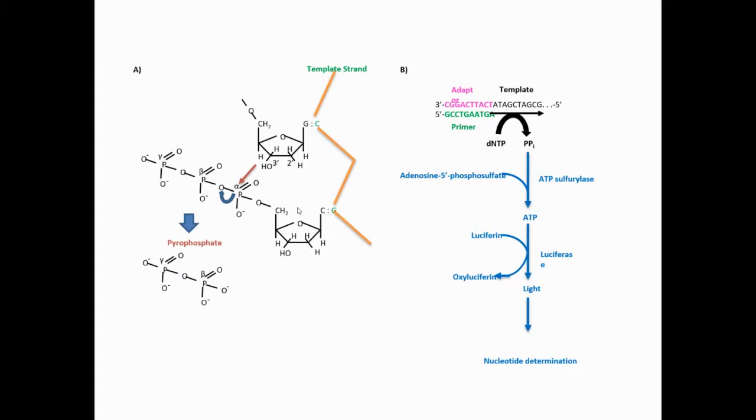Very good. So after these two technologies were developed and used in research in the industry for many years, later on, in the late 90s and early 2000s, when they tried to sequence the human genome from the Human Genome Project, they realized this is very slow.